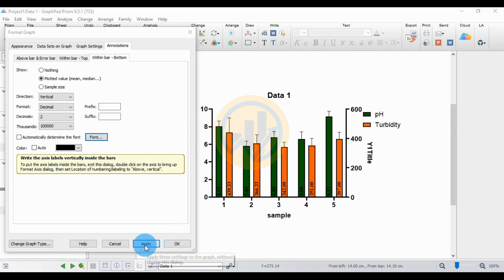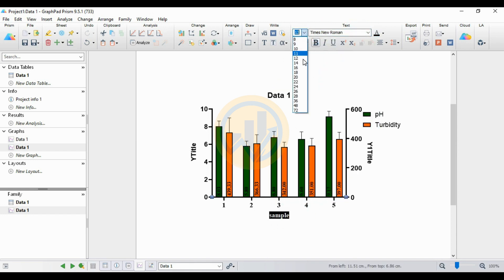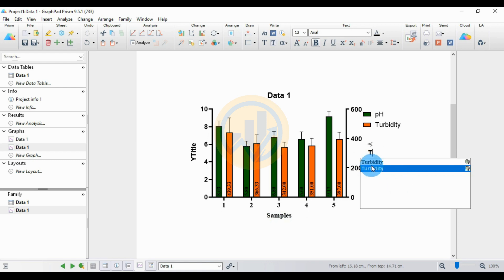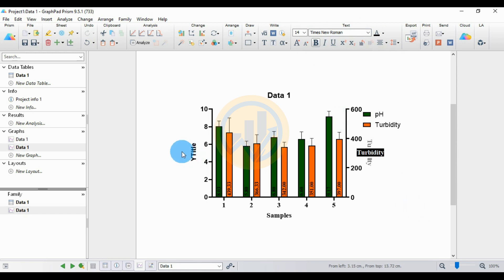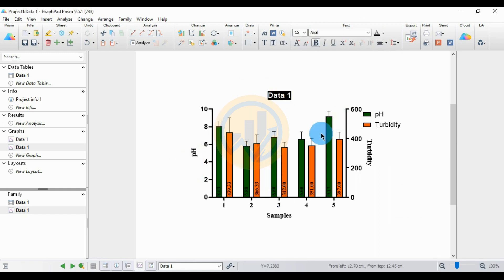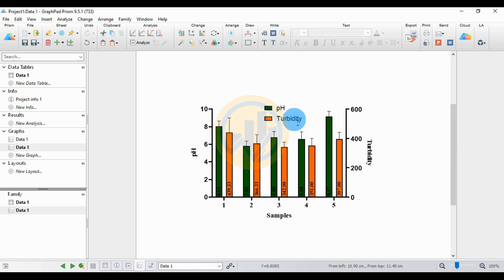Next, change the font for the sample labels and the Y axis. Change the font to Times New Roman size 14 for the sample labels. For the right Y axis, enter the name for turbidity and use Times New Roman size 14. For the left Y axis data, enter pH. Select the group labels — pH and turbidity — then click the Control button, select both options, and move your mouse to center them.